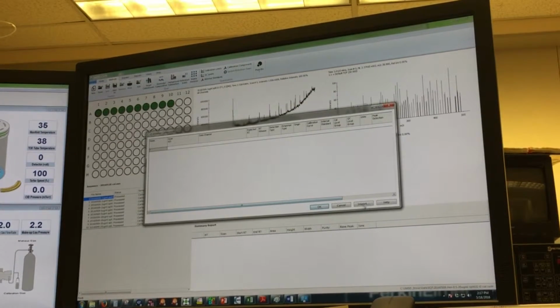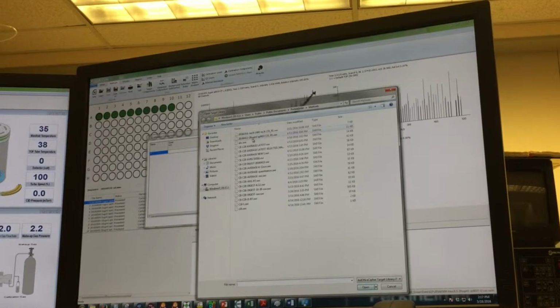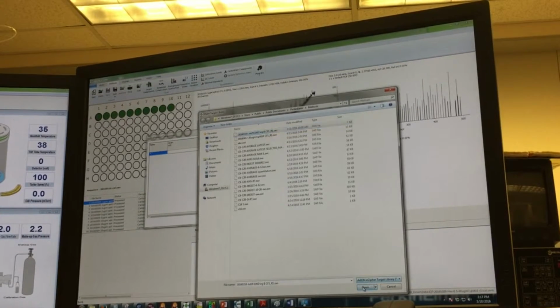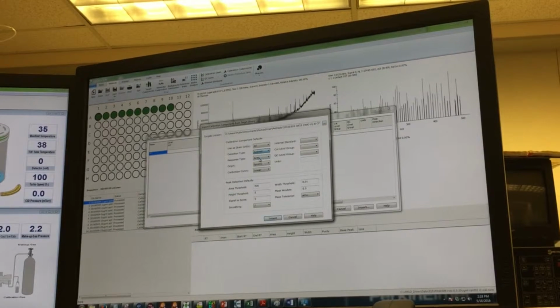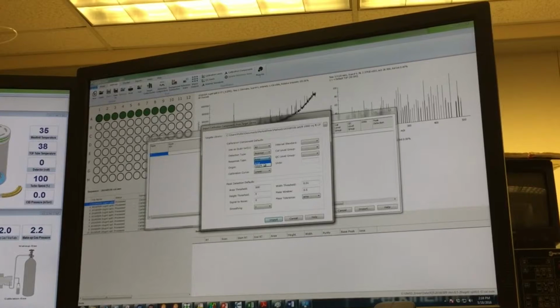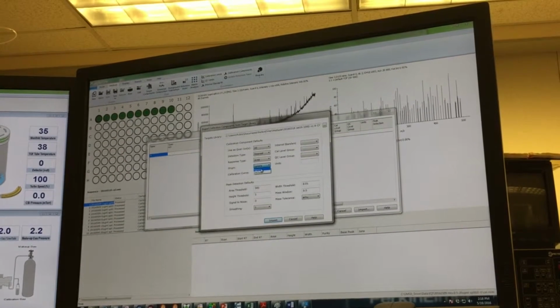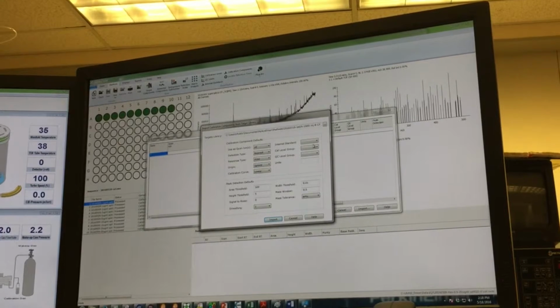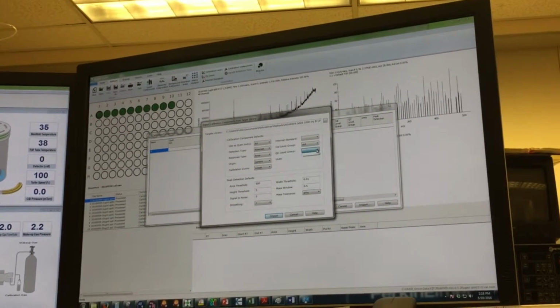Calibration component, import, upload this one. Then here, detection type, instead of highest, click on nearest. The response type is always area, don't click height, area. Origin, ignore or include, whatever you want, both work. For cal component, click on standard. Show level, it doesn't matter.